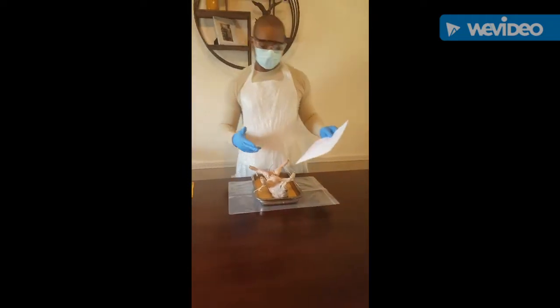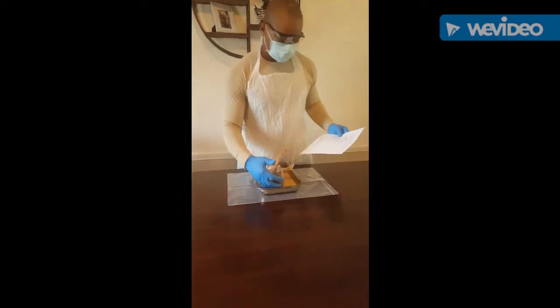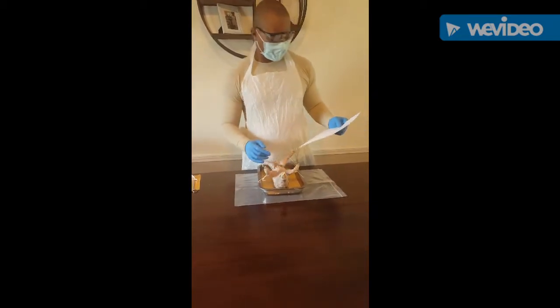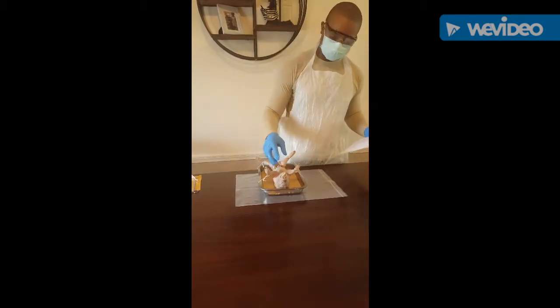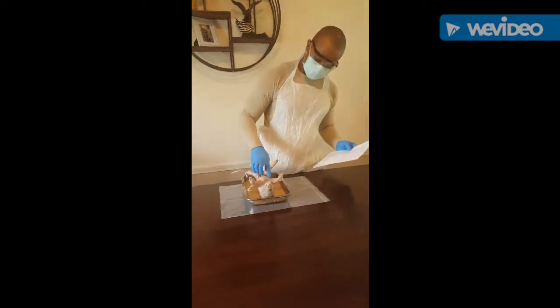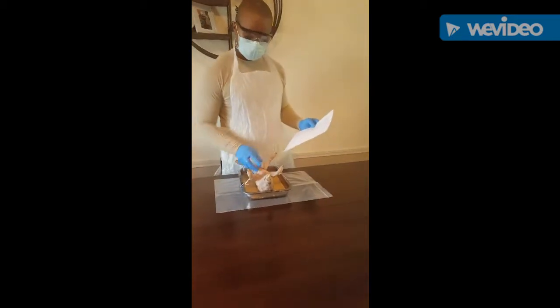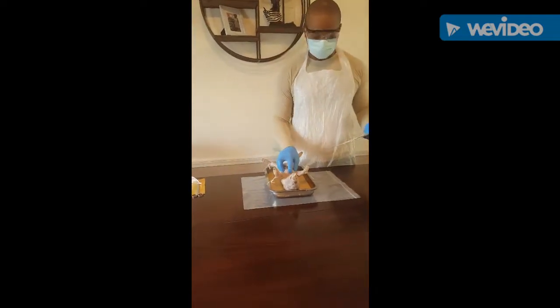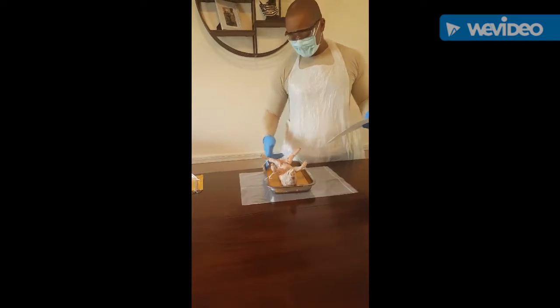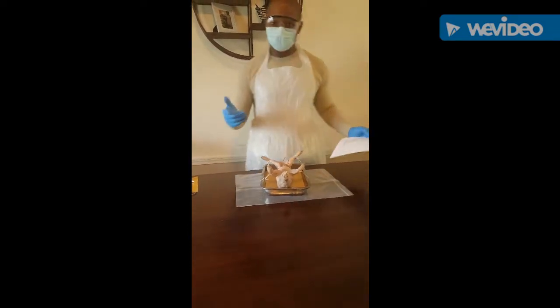So we're going to go over the introduction of the fetal pig, starting with the exterior. All right, we have the head region here. Pretty self-explanatory. We have the neck region here. Goes all the way around, obviously. The trunk consists of the skull, the thoracic cage here, and also this area here, not your limbs, but this is here. And then you have your tail region. Obviously, it is going to be coming from that pelvic region over to where the tail is at.